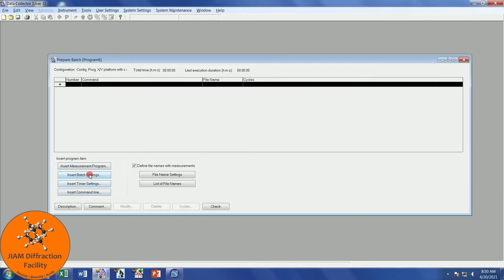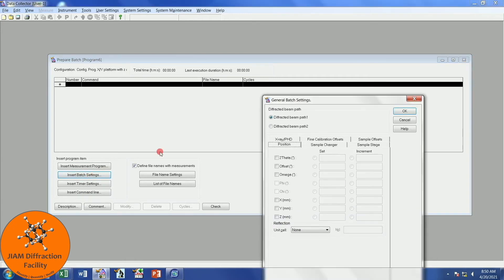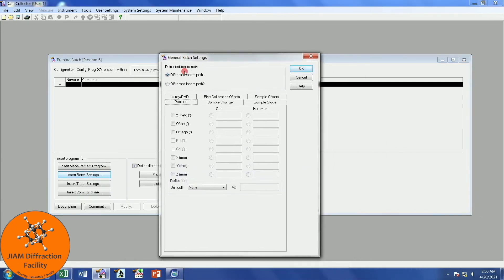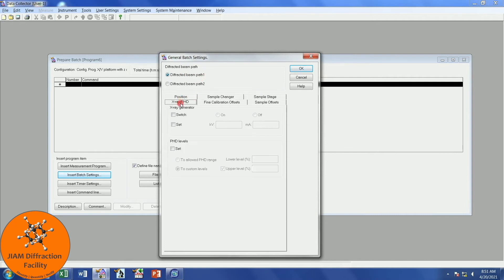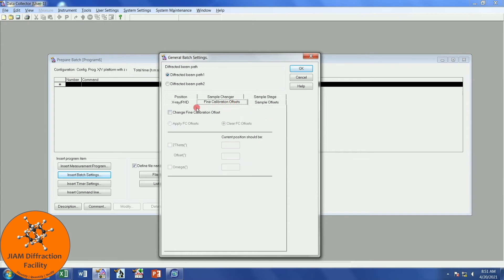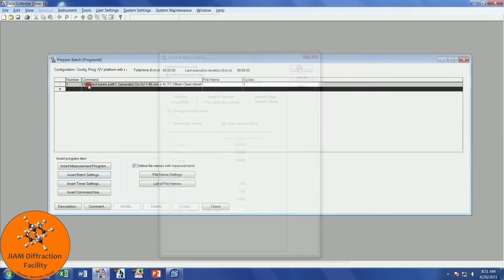We see here that we have command lines. And here we have items that we can insert into the program. First, we want to insert a batch setting. Left-click. We are on Beam Path 1, so that's good. I will come here to X-Ray PhD, and I will make sure that it is switched on. And I will set it so that it is 45 kilovolts and 40 milliamps. Let's go to Find Calibration Offsets. We are going to change them and clear them, just in case someone previously saved offsets. We will do the same thing under Sample Offsets, change them and clear them. Click OK.